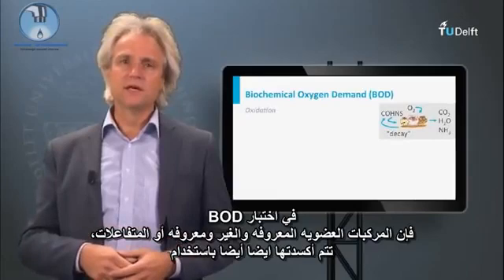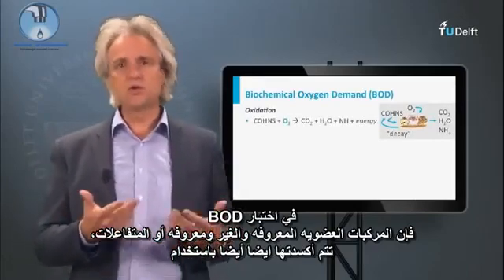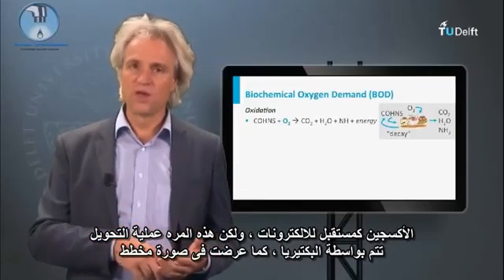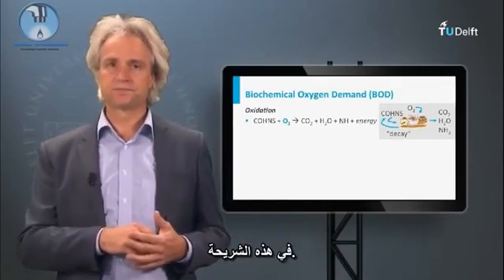In the BOD test, the known or unknown organic compound or substrate is also oxidized, using oxygen as electron acceptor, but now the conversion is performed by bacteria, as schematically presented in this slide.